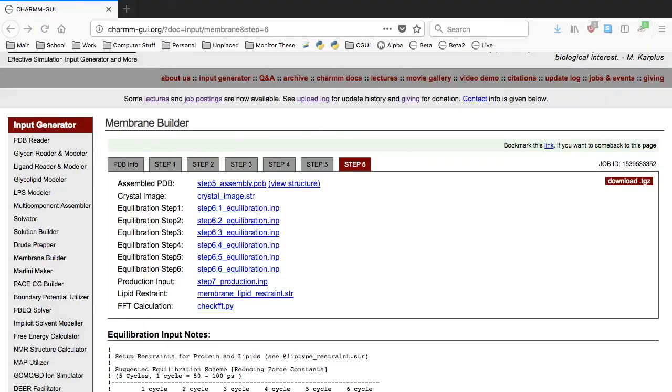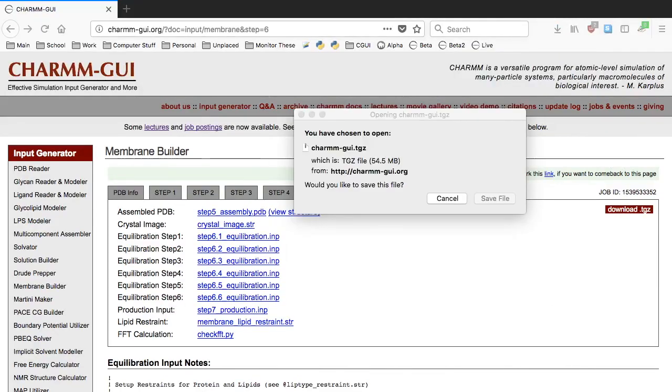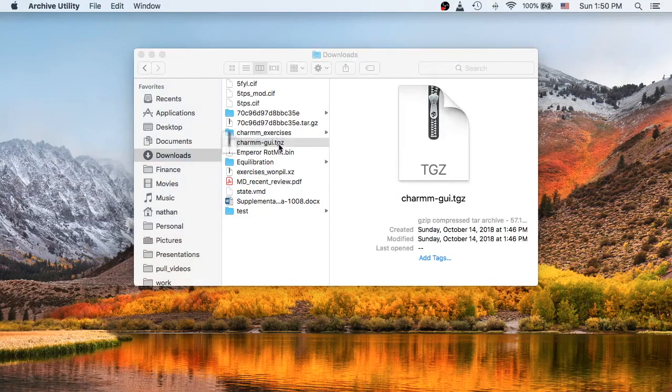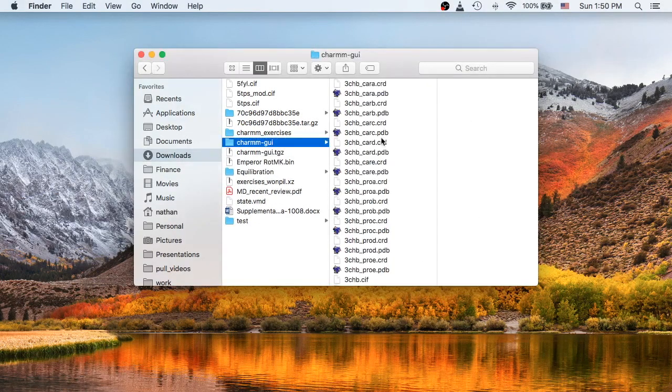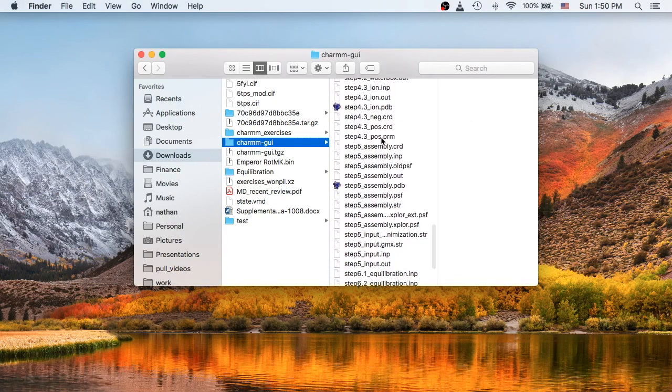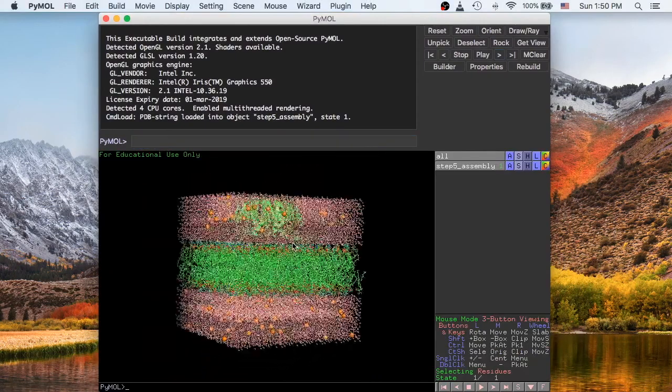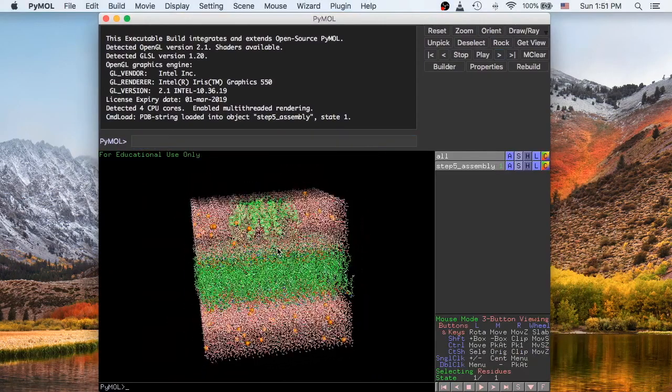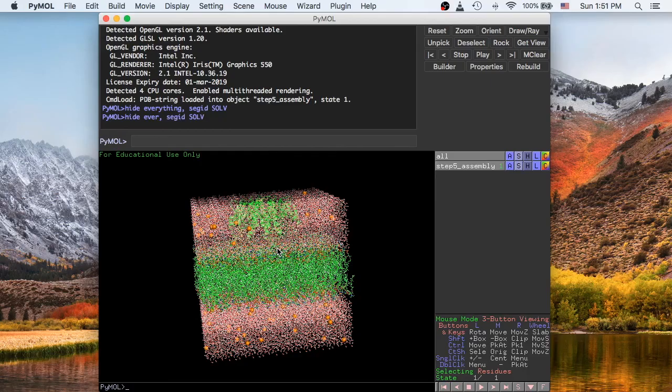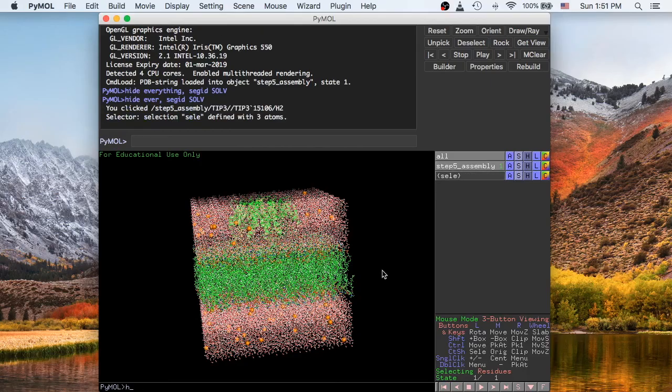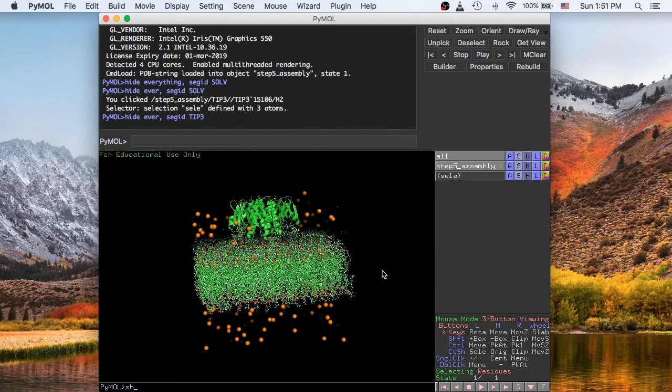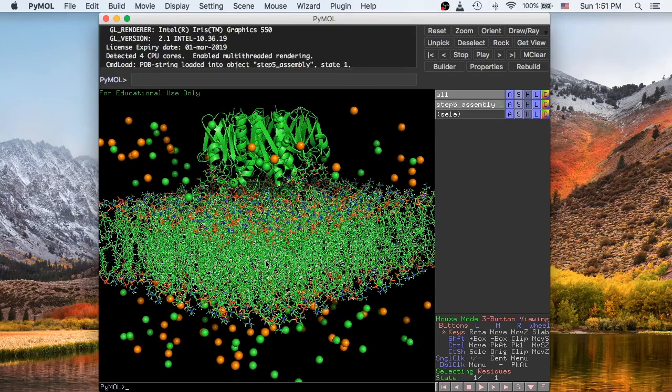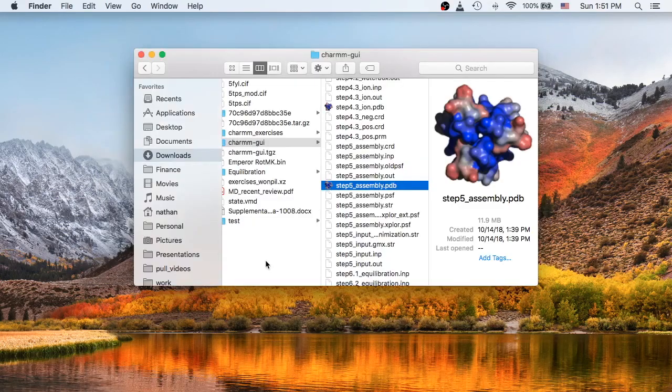When it finishes, you can download your project directory. You should check the Step 5 assembly structure to make sure that it's reasonable. Then read the readme file in the GROMACS directory to run equilibration and production.